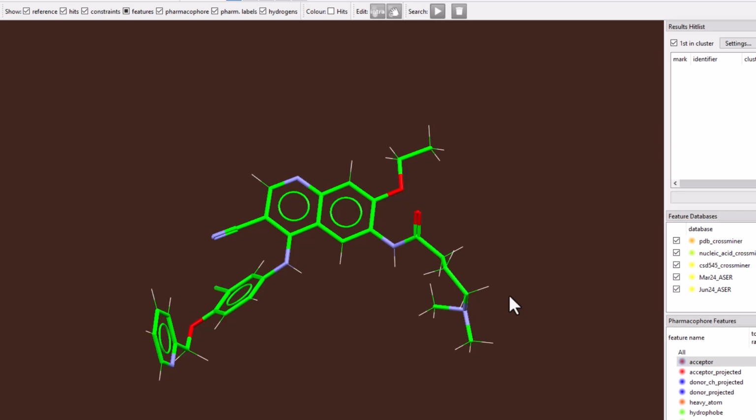I'm going to create a Pharmacophore model of this molecule. I'm not going to cover how this Pharmacophore model is created because its creation is a very challenging task and requires a lot of knowledge and experience and probably a one-year course on this. But here we're just going to build a Pharmacophore model and conduct a search to understand how CSD-CrossMiner works and which results it can give you.